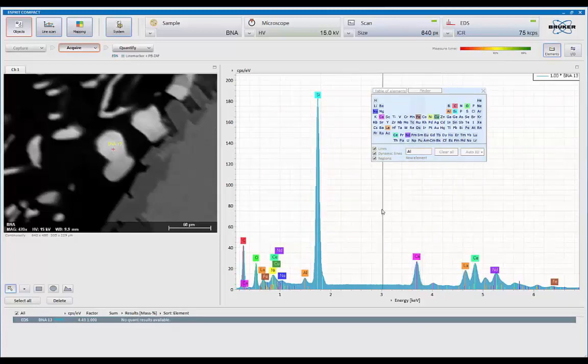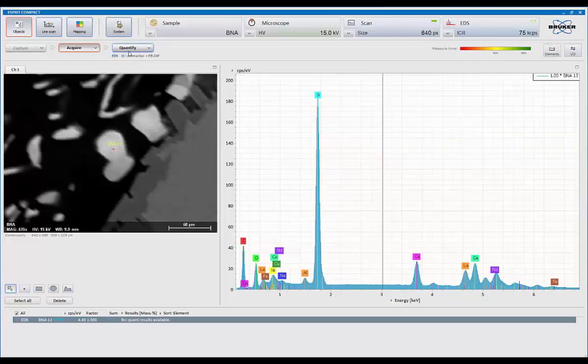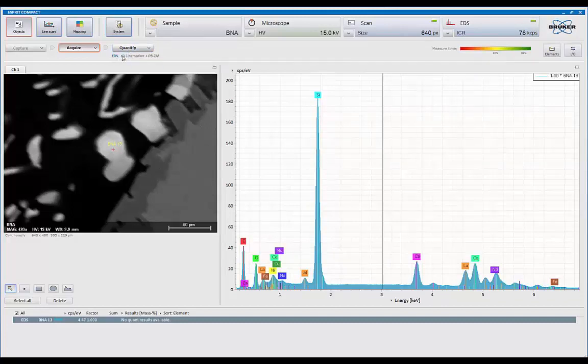Now, basically what Auto ID is really doing is a full quantitation. So I can use the same tools that Quant has. So when we do quantitation, we can either tell the system based on the KLM markers and the method I have. So right now, I'm using a method called line markers plus peak to background, ZAF.